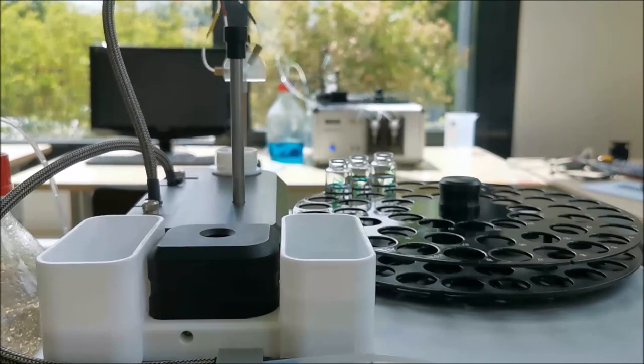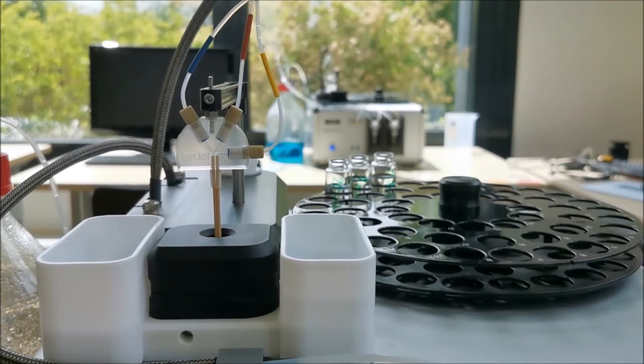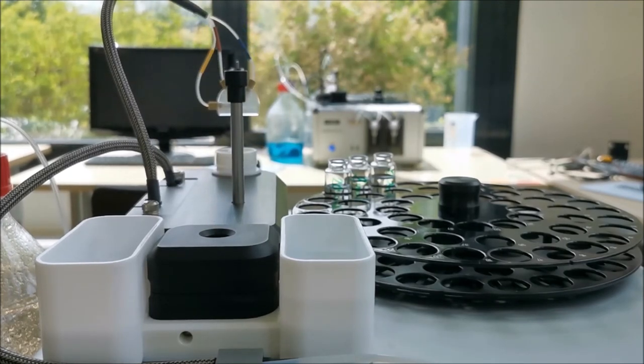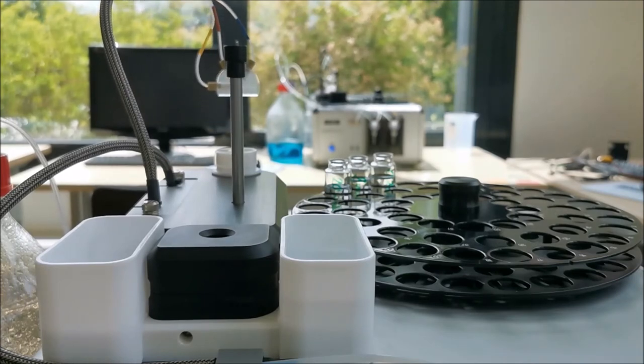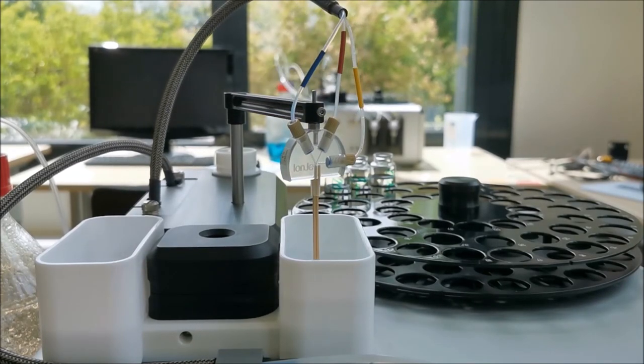And the measurement begins. The yellow labeled tube removes solution from the sensor well to achieve a continuous flow of solutions through the sensor. After the measurement, there is an additional rinse step with non-activating solution to get rid of remaining substrate within the sensor. The ion jet takes up non-activating solution for the additional rinse step here.